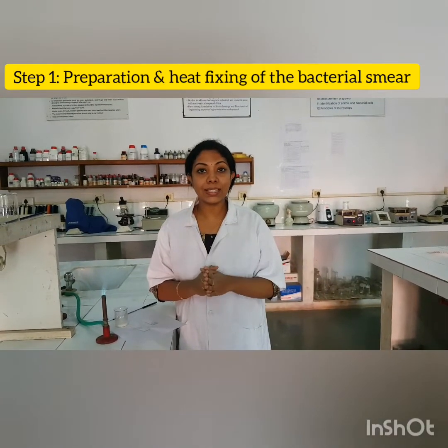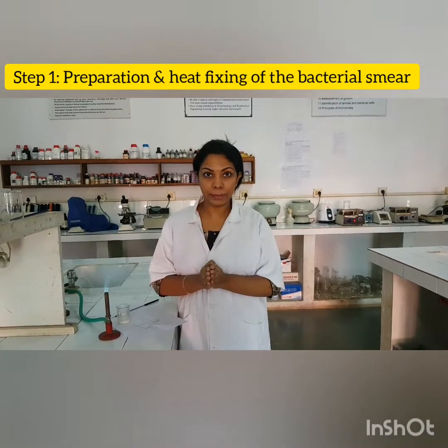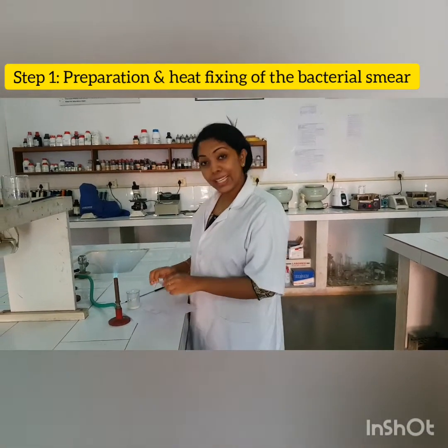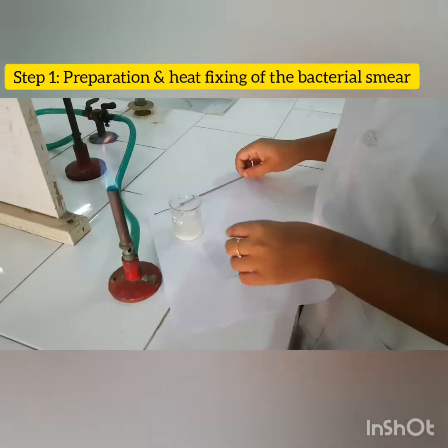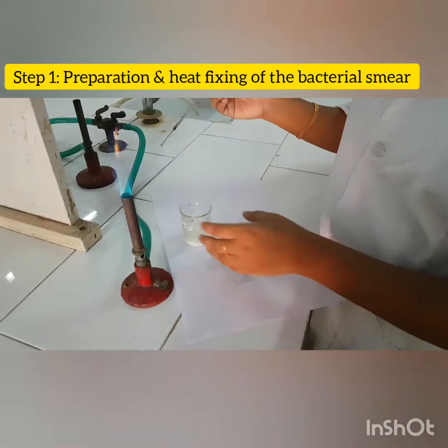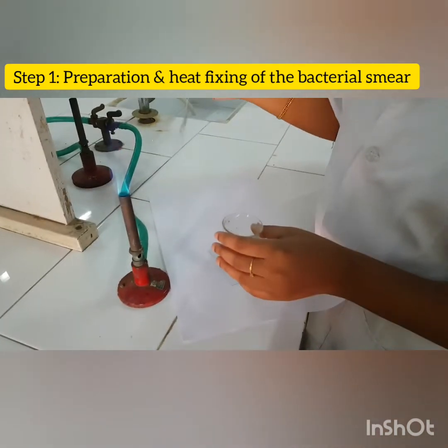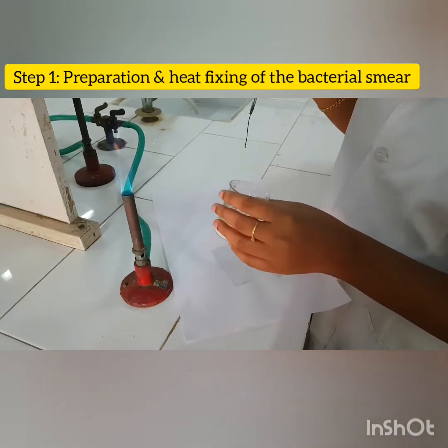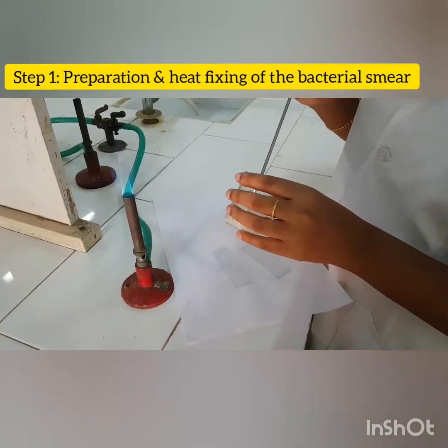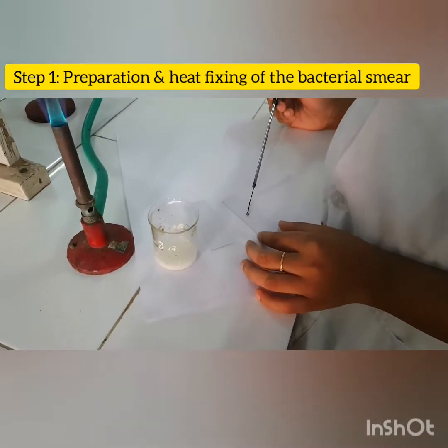smear. The first step in endospore staining is the preparation of the bacterial smear and heat fixing of the same. So for that we have to take a clean microscopic slide, the bacterial suspension, and a sterile loop. With the help of a sterile loop, take a loop full of bacterial suspension and prepare a clean smear.